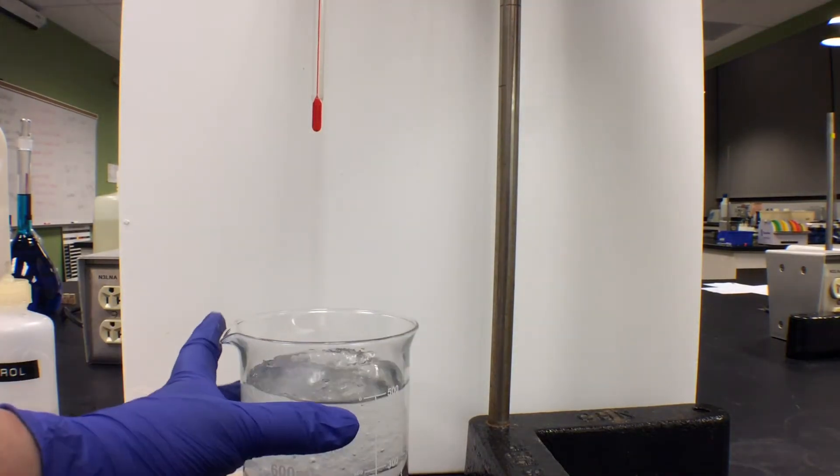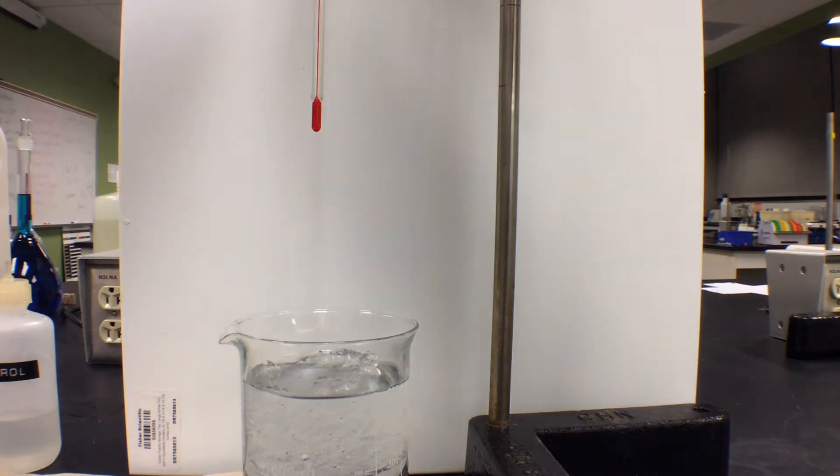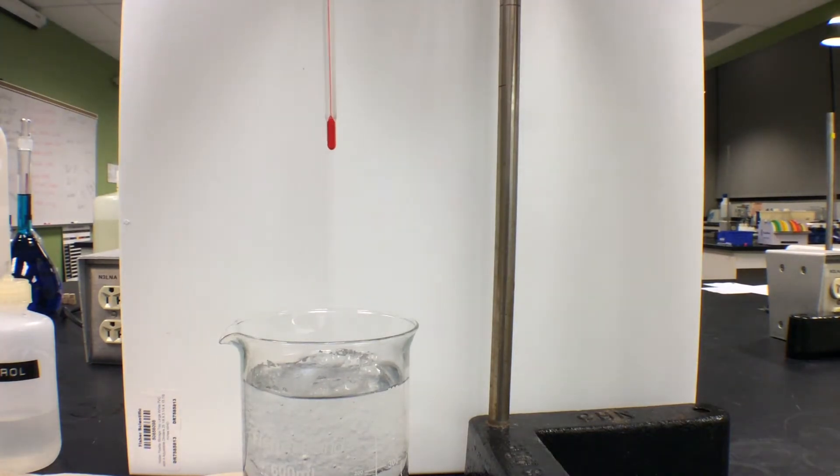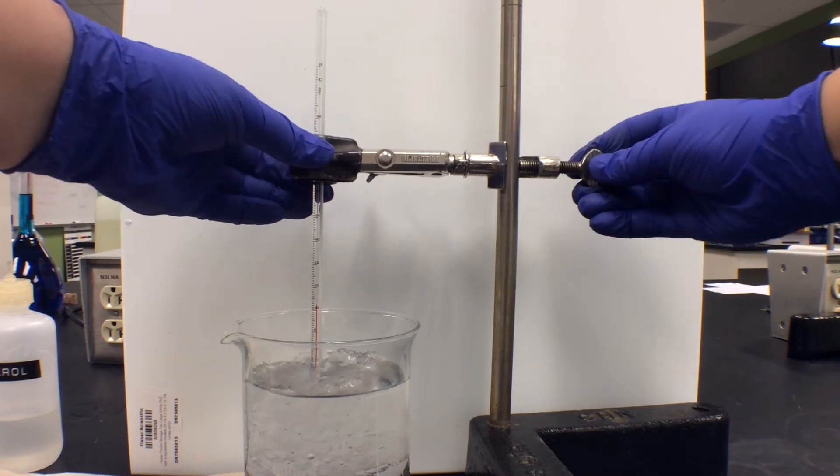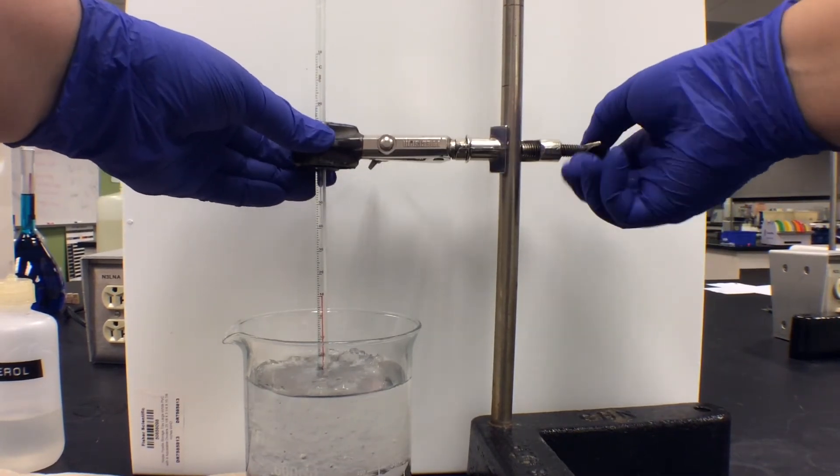Adjust the height of the thermometer and slide the ice bath underneath it. Bring the thermometer back down and make sure the bulb of the thermometer is surrounded by ice and is not touching the sides of the beaker.